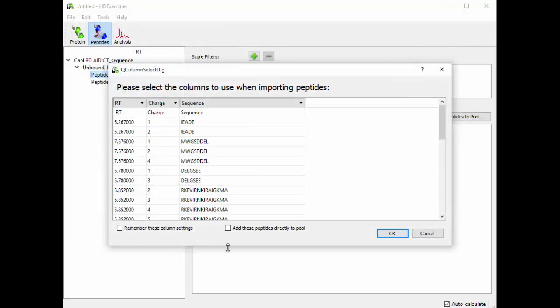When you import tabular data, it pops up this window to show you which columns are in your table. HDExaminer needs, at a minimum, a retention time column, a charge column, and a sequence column, and it needs that data for every peptide. In this case, the table I'm importing has only those three columns, so it knows that this is retention time, charge, and sequence because of the labels that are in the file.